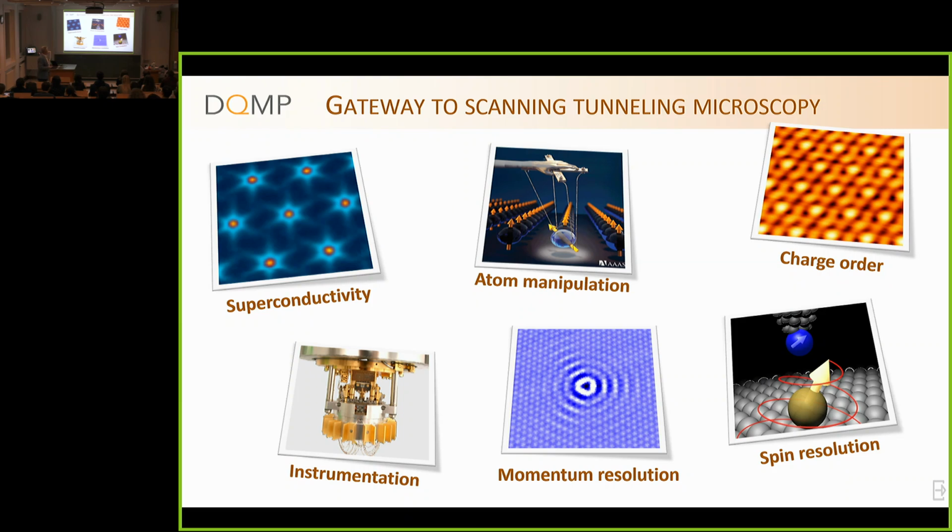Okay, so these are the basic principles, and now, as I said, I will not have time to talk about everything. I've prepared six topics, and it's up to you to tell me which one you would like to know. I can tell you more about superconductivity, single atom manipulation and what you can do with it, charge density waves, a bit more about instrumentation, and then two quite specific techniques. One that gives us momentum resolution, which in the early days was really not something obvious to do with STM.